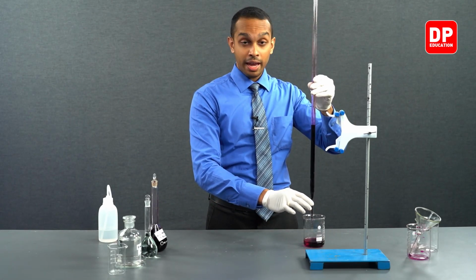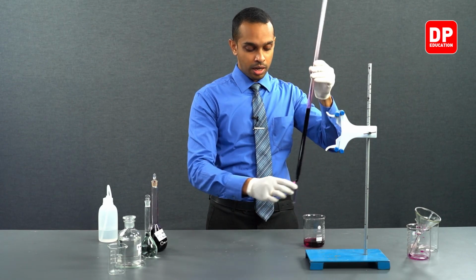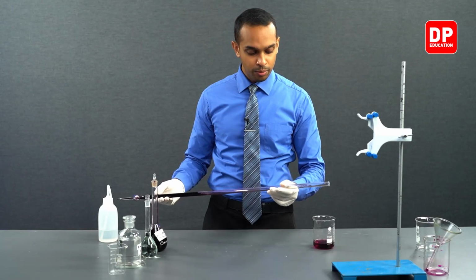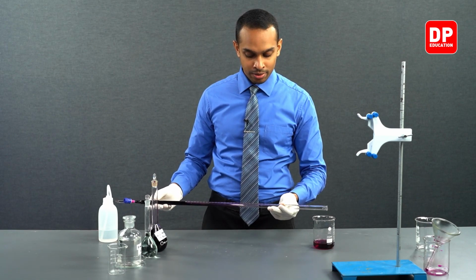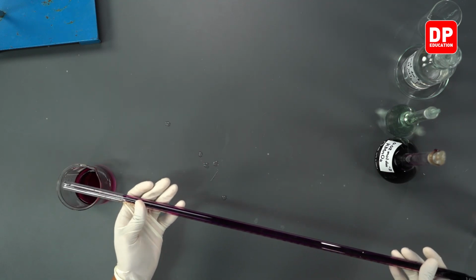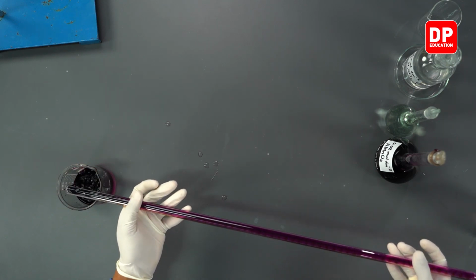Now, like in the previous example, I will be turning this sideways like this and making sure the entire interior surface of the burette is completely washed properly with the solution that is about to be filled into the burette.